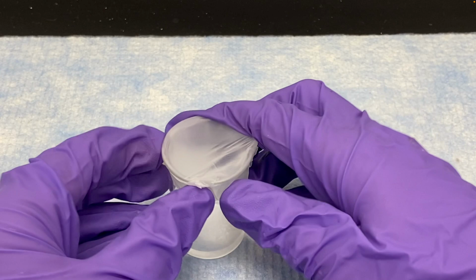Probably the easiest way to do that would be gentle heating. You could also just let it sit for a couple hours. Or if you wanted to speed it up without heating it up, you could take a stream of nitrogen. The air that we breathe is 78% nitrogen. So some fume hoods have nozzles for nitrogen gas, which is inert and doesn't react with anything. But when it hits the top of a liquid, it makes it evaporate faster. So that's another way you can evaporate it. Once the ethyl acetate evaporates, there will be a film of solid that's left, and that'll be the camphor.